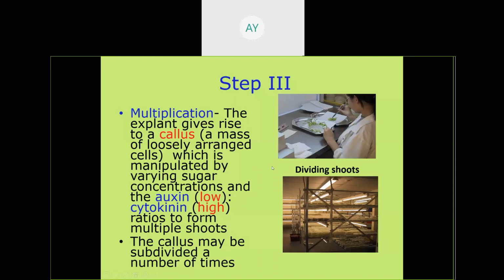देन यू विल डिसाइड इन व्हाट यू हैव टू प्रोड्यूस. आइदर फर्स्ट यू प्रोड्यूस द स्टेम and then root. तो फर्स्ट स्टेम बनाना है तो साइटोकाइनिन कंसंट्रेशन ज्यादा होगा. आफ्टर फॉर्मेशन ऑफ कैलस, आई एम टॉकिंग अबाउट आफ्टर फॉर्मेशन ऑफ कैलस. इन दैट सिचुएशन मीडिया कंटेन इक्वल क्वांटिटी ऑफ ऑक्सिन एंड साइटोकाइनिन.